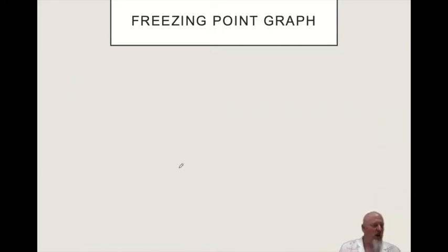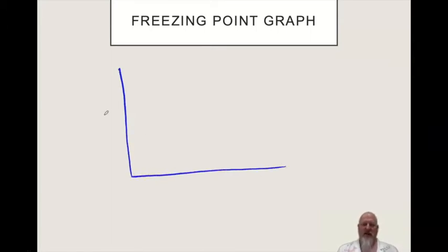All right, so like I was just saying, when we do the paradichlorobenzene, we're going to make a graph that's got temperature here and time down here. So initially our temperature is going to be pretty high. I think we start at like 65 degrees Celsius. Remember, your thermometer reads to 1 decimal place, and that decimal place is a 0 or a 5 depending on where it is relative to the lines on the thermometer. And then we're going to watch what happens.